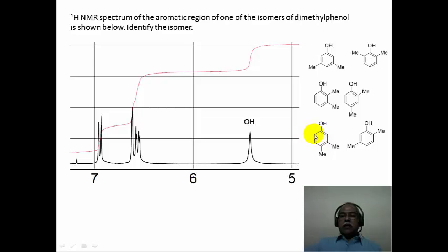And if you take this hydrogen, which is ortho to the hydroxy functional group, that should have a large coupling with the meta hydrogen here, which is in this position here. So that will be an ortho coupling, and that may exhibit again a small amount of a meta coupling. So this would be essentially a doublet of a doublet.